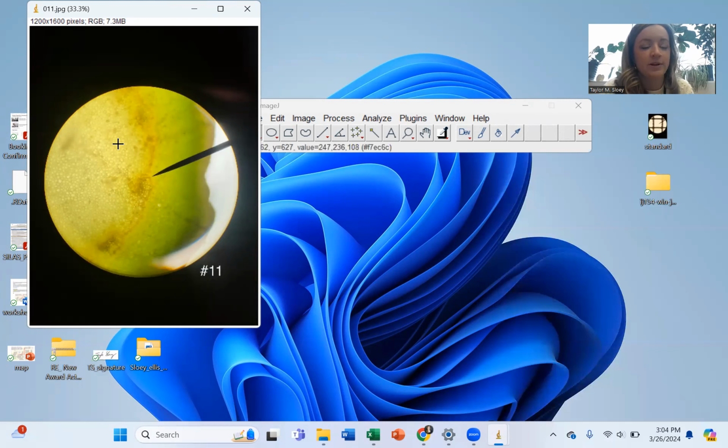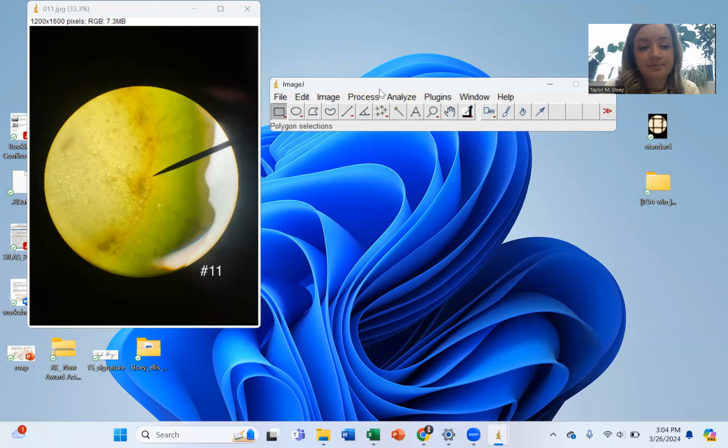It's just a small snapshot of the total plant and all of the xylem that would be in the plant. But for this exercise, we will be measuring as many xylem vessels, which is an individual circle, as possible within one of these bundles. So don't measure them for everything, just choose the most clear bundle and measure all the xylem vessels within that. But before we can do that, we need to set the scale.